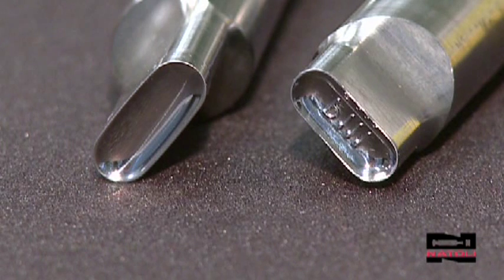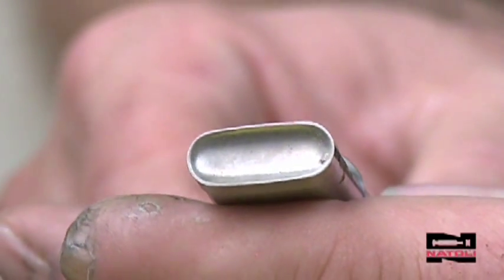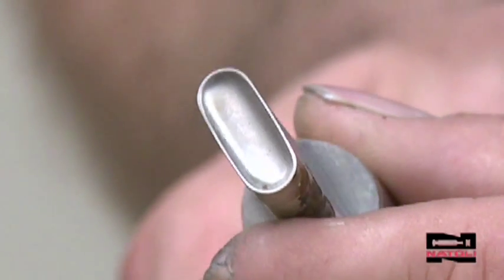The dental brush process can restore luster to your cups within minutes. Here again, it's real dull — there's no shine to it. Good possibility your product will stick into the cup.